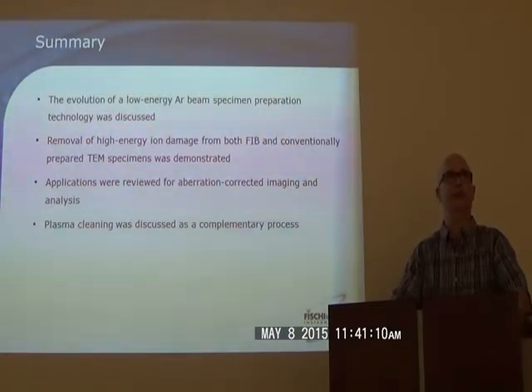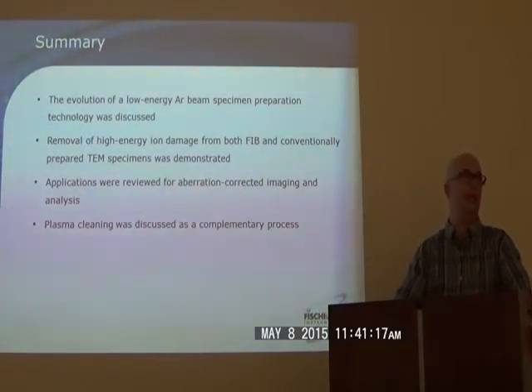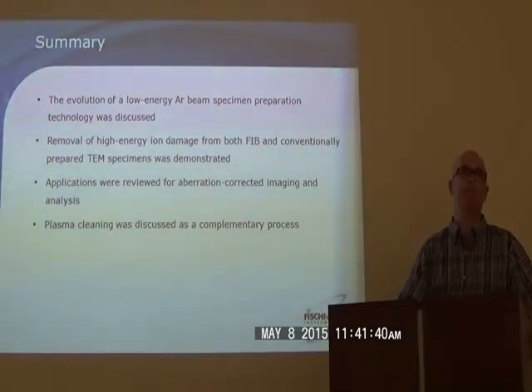Thank you very much. Will Pico replace NanoMill? I think that's a question probably for sales and marketing. Or maybe Mike could comment. Mike's shaking his head. No, it won't replace it. They're for two different markets, price points, whether you need the ability to do endpoint detection. So no, it won't replace it.